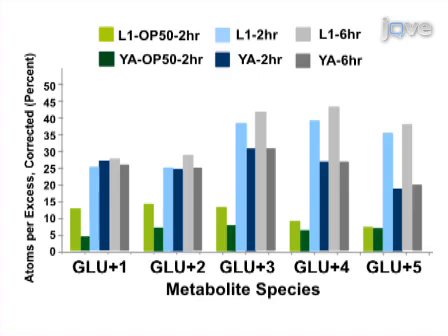YA represents worms fed with carbon-13 glucose and OP50 bacteria for 48 hours beginning when they reached the first day of egg-laying young adult stage. The x-axis indicates the total number of labeled carbon atoms in each glutamate species, and the y-axis indicates percent enrichment. All animals were cleared of excess isotopic label prior to downstream sample preparation for GCMS analyses.